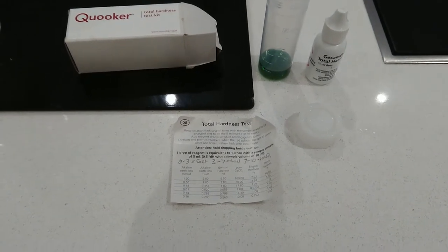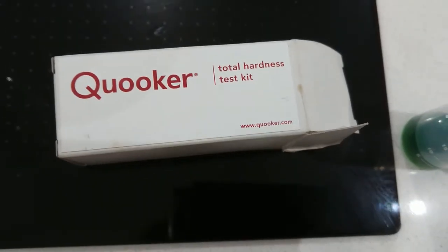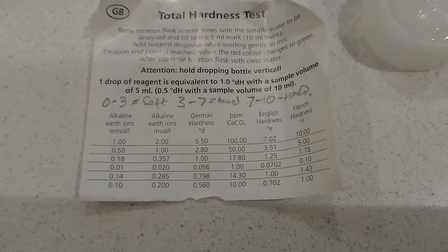Hi, it's just a quick video to have a look at this Quooker hardness test. I don't know whether you've tried to do it or not. It's gonna be really short because I found this really confusing, however I've gone through it.